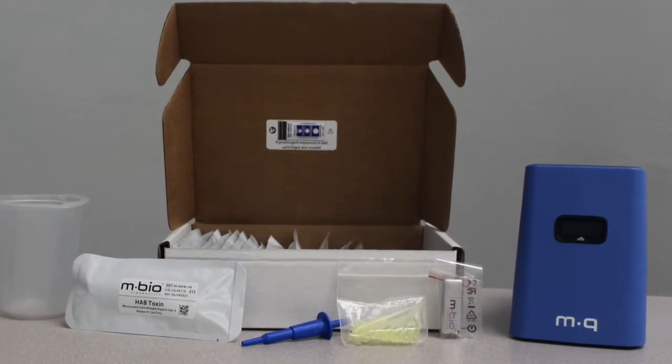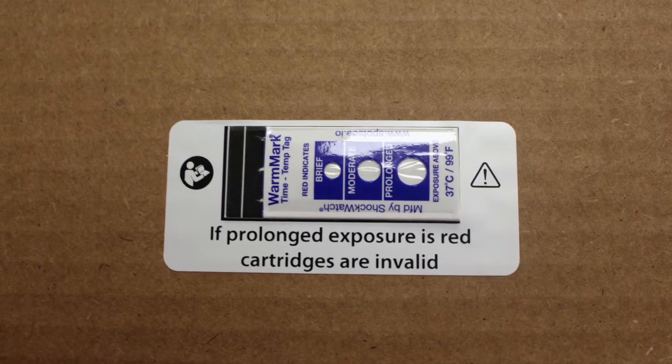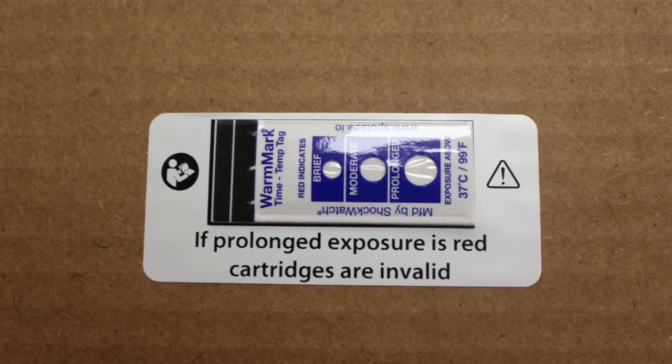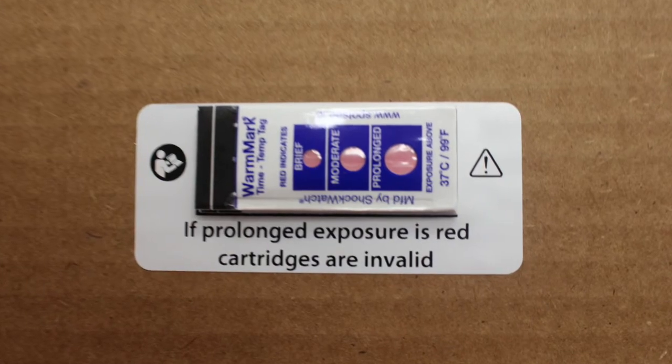Check the inside lid of the cartridge kit for a temperature sensor. If the prolonged exposure circle is white, the cartridges are ready to be run. However, if the sensor is red, contact MBio for replacement cartridges.